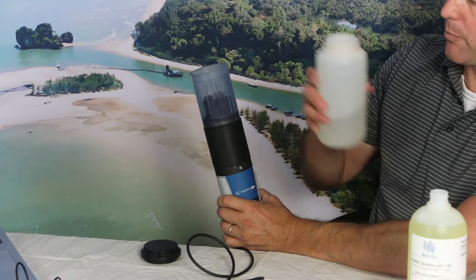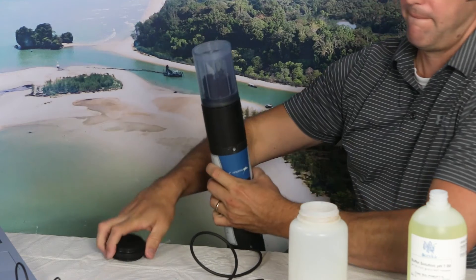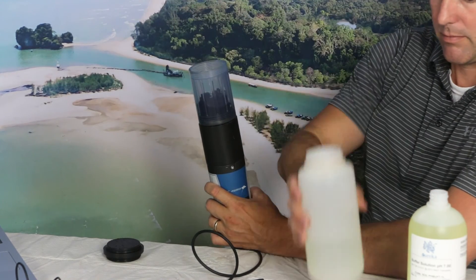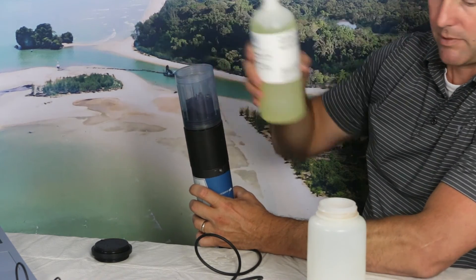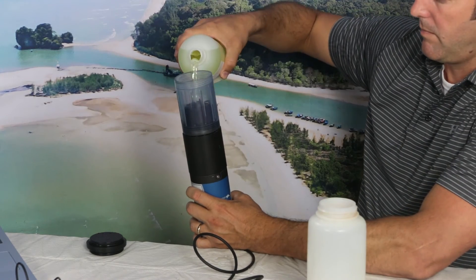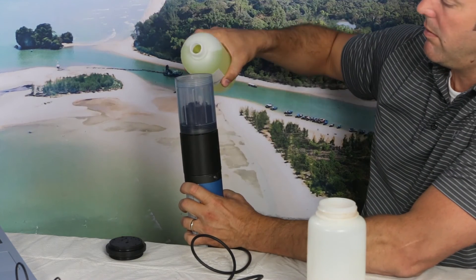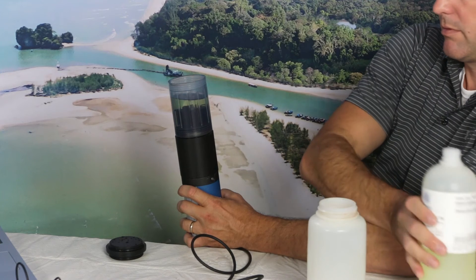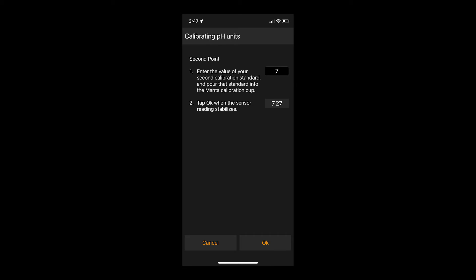To calibrate your second point, we're going to do our rinsing process once again with DI or RO water — two rinses with water, then two rinses with our pH 7 buffer. Finally, fill the cup up to where all of your sensors are submerged. Wait for the reading to stabilize and then click OK. You will then be prompted to calibrate your second point. With your second calibration solution in the cup, type the value of the solution, wait for the reading to stabilize, and then tap OK.